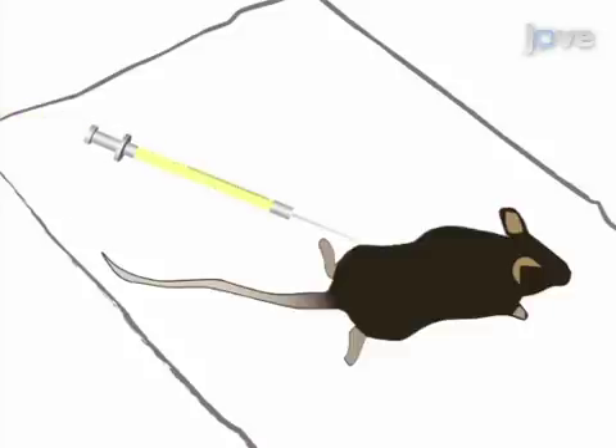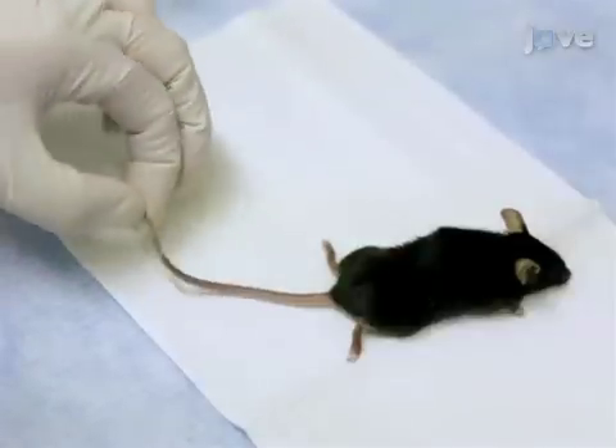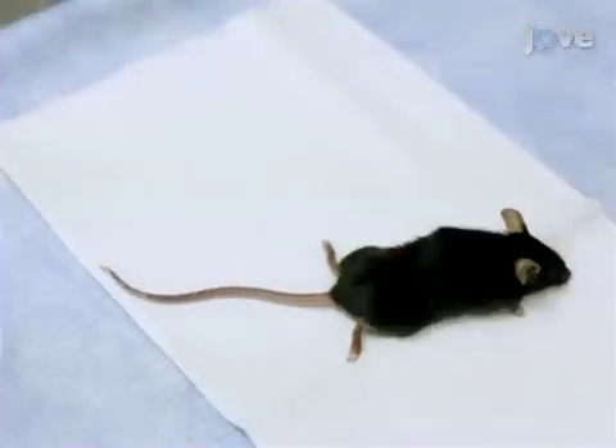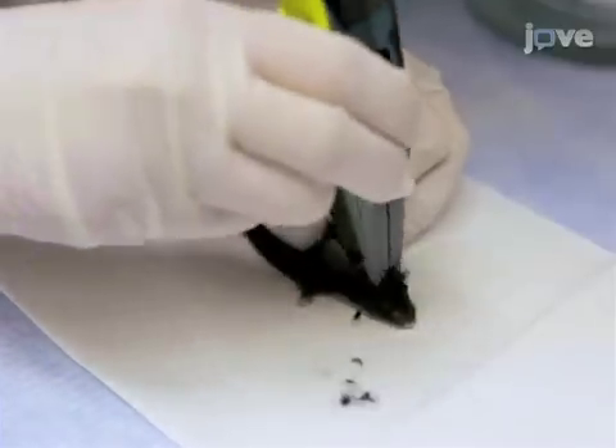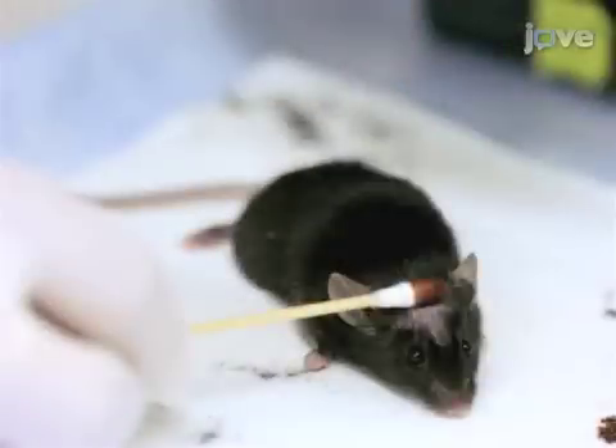After injecting the mouse with an IP injection of a ketamine-xylazine cocktail according to the text protocol, perform a tail pinch to check the level of sedation. Next, shave the head between the ears and eyes and use sterile cotton applicators to clean the area with alternating washes of ethanol and iodine.